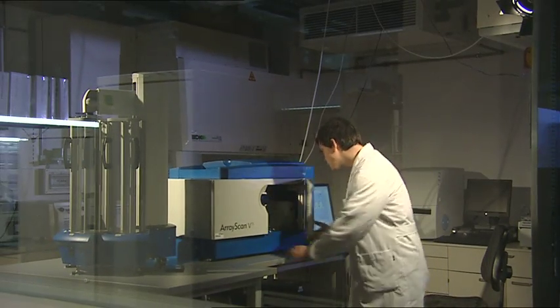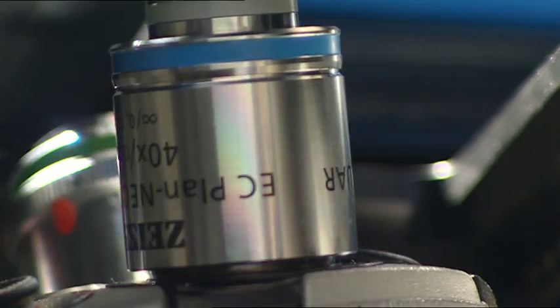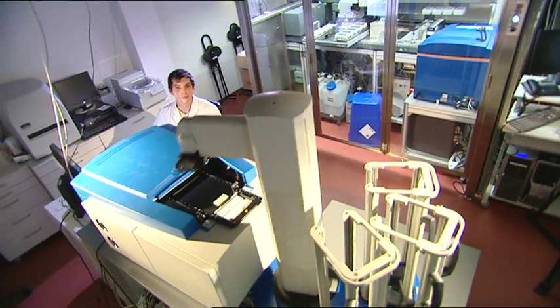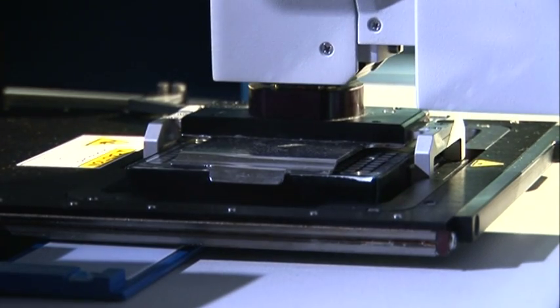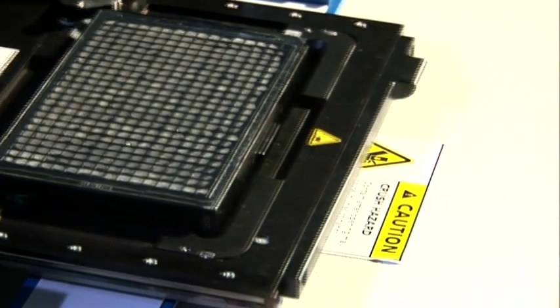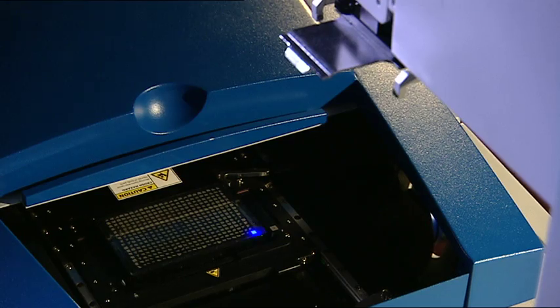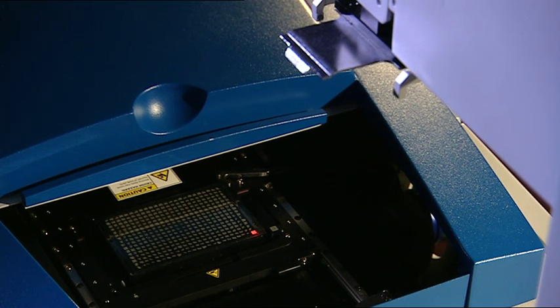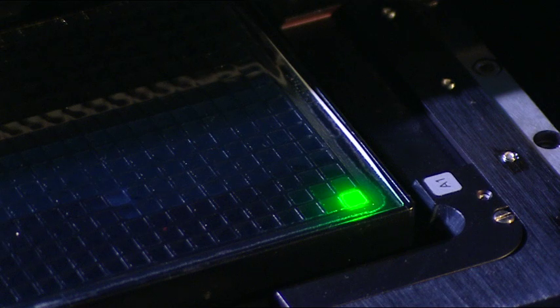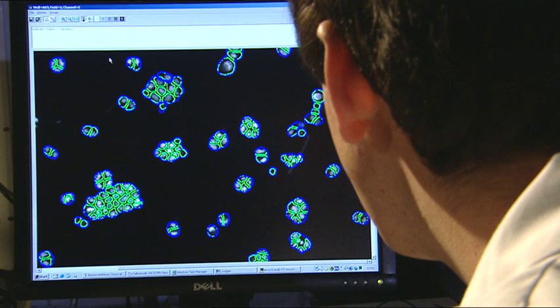On the one hand, the function of the proteins that are examined in the screening department serves the search for active ingredients. On the other hand, the scientists also want to find out the cellular target of the active ingredients. Using automated microscopes, they therefore examine the communication paths of the cells. These paths are especially significant for cancer. With the help of a test in cell cultures, migration of tumor cells from the cell colonies can be observed, for example. This process corresponds to the formation of metastases.